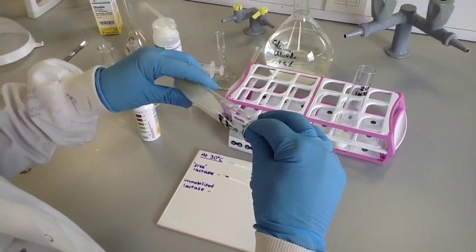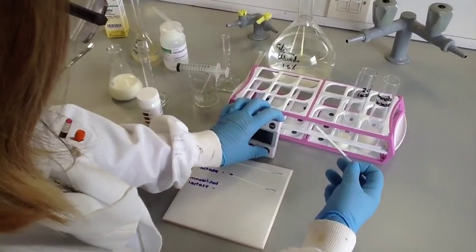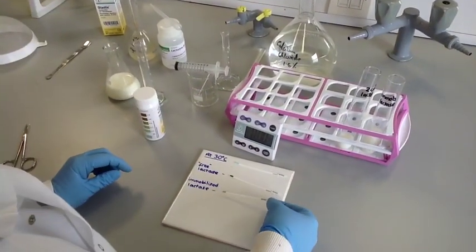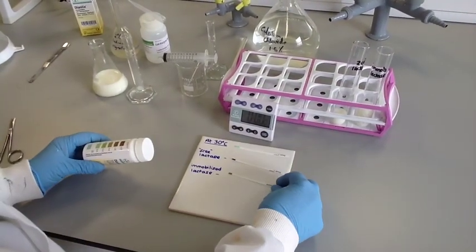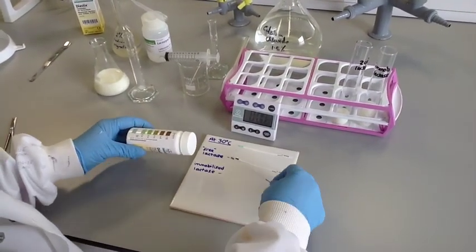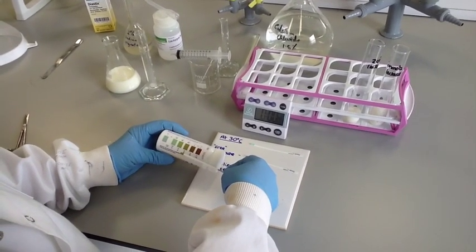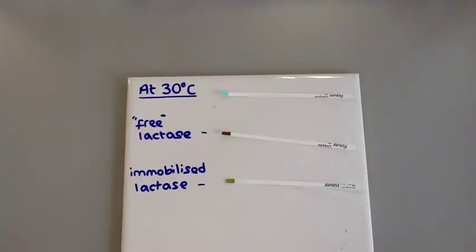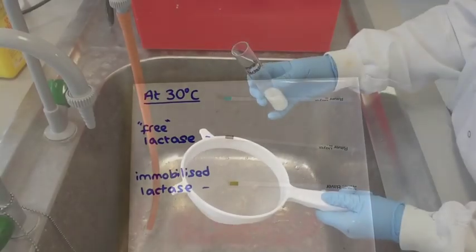However, there is more glucose present in the milk with the free enzyme. Students could discuss this with reference to the easier movement of the free enzyme and therefore possibly greater availability of active sites. And here you can clearly see the greater amount of glucose present with the free lactase.